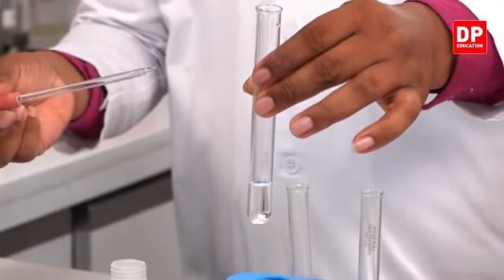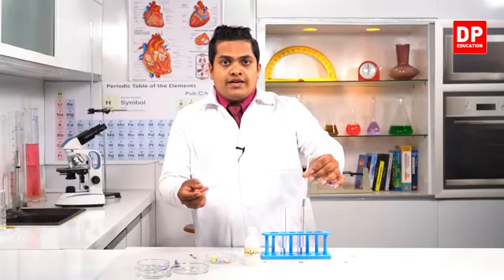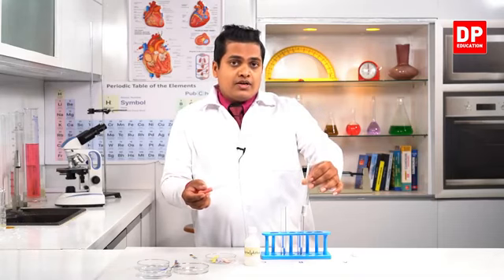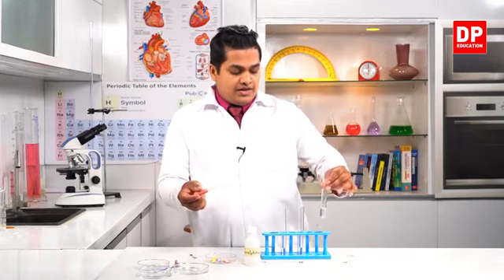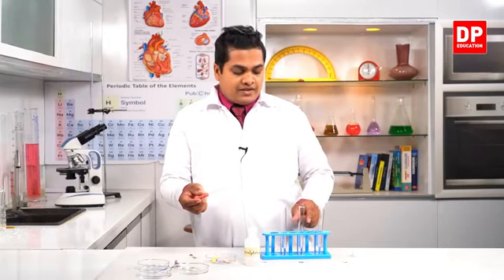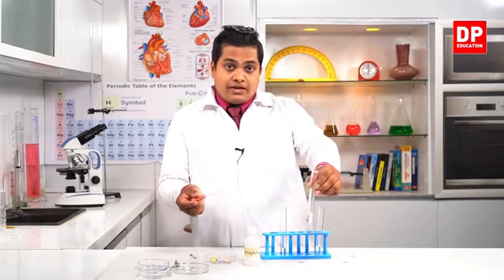There is no change in the color. So I told you that we use phenolphthalein just to identify bases. So with bases, phenolphthalein is giving out a pink color. So we'll keep it in here, the A solution, HCl.